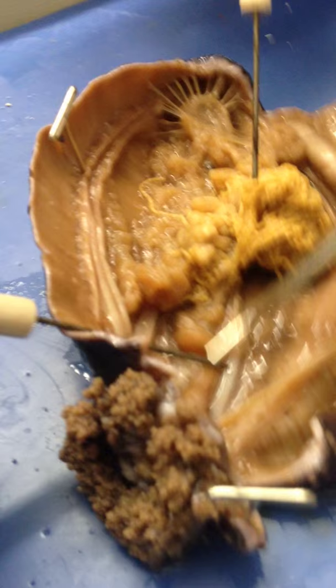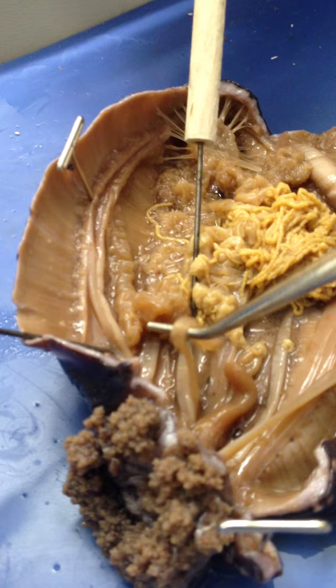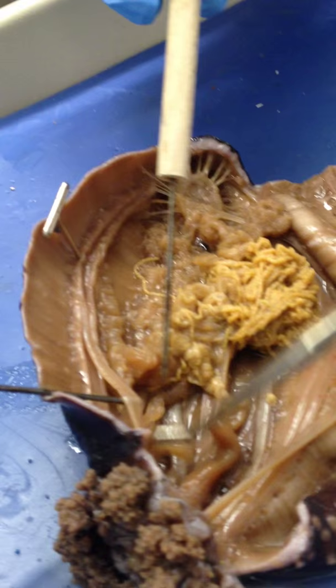The Polian vessel — what is that called? I don't know, but it's right here. The Polian vesicle is right here.